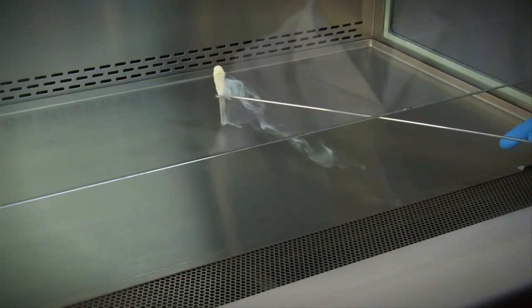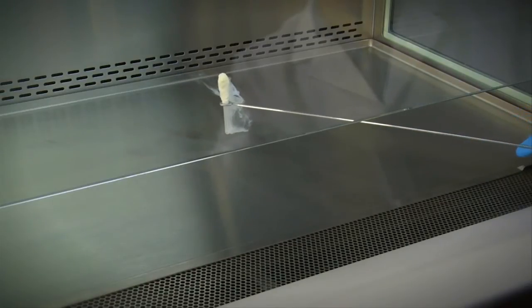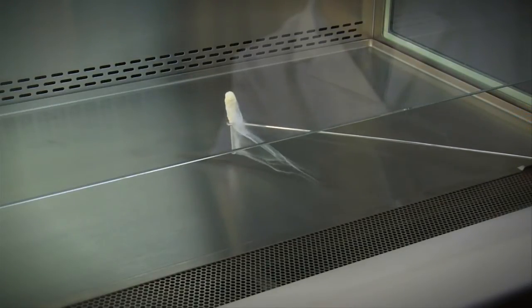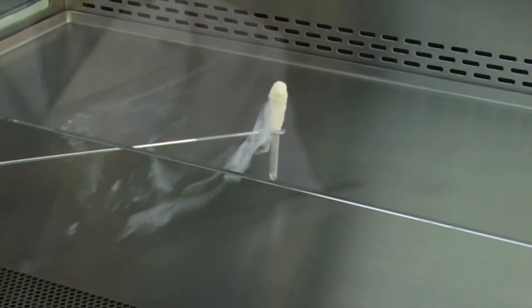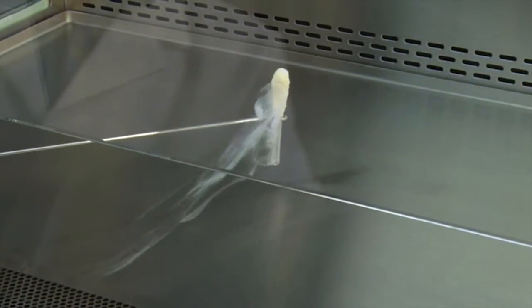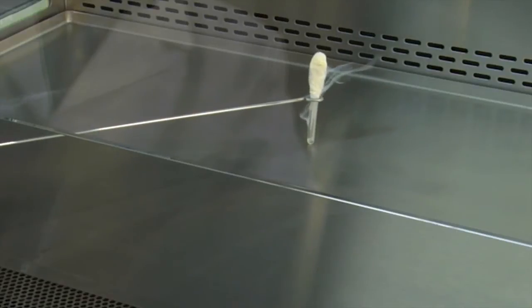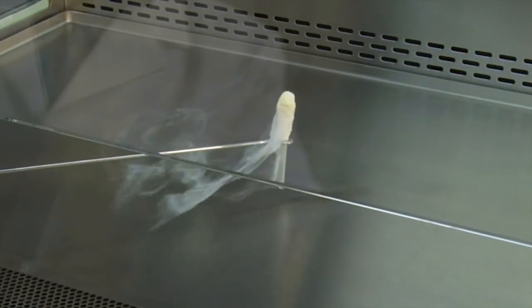Creating true laminar airflow over the work surface and thereby minimizing cross-contamination. Exhaust air passes through a HEPA filter before entering the laboratory and or world environment.